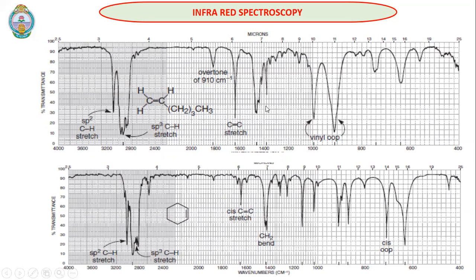Don't try to identify all the peaks. In IR spectra, we do get many more peaks than we are supposed to. So don't go for interpretation of all the bands. We just need to pick the bands which will match with our compound. Just ignore the additional bands.